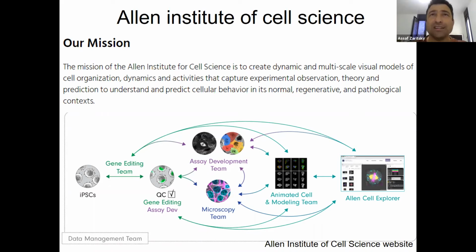They are imaging tons of high quality 3D images of the cells under different conditions and different organelles fluorescently labeled. So they're making huge amounts of microscopy data that is publicly available. It's really, really high quality, and you can use it to develop tools, to ask questions, to visualize and just stare at these images to gain some insight, as they are developing computational tools and letting the field use them.